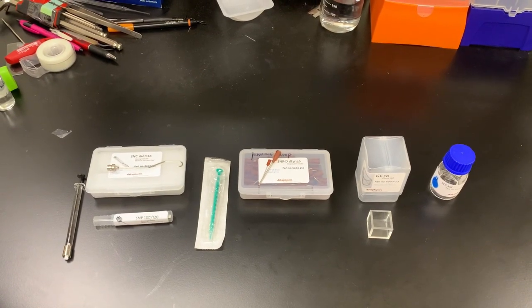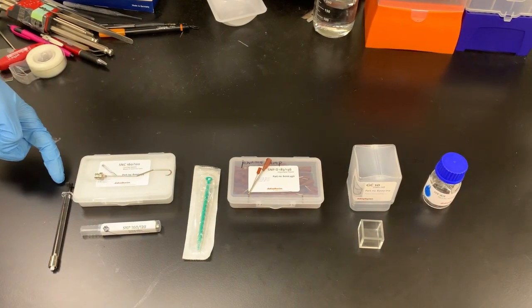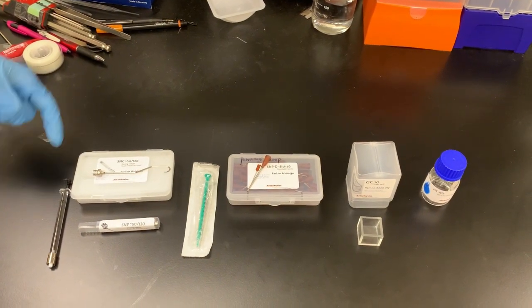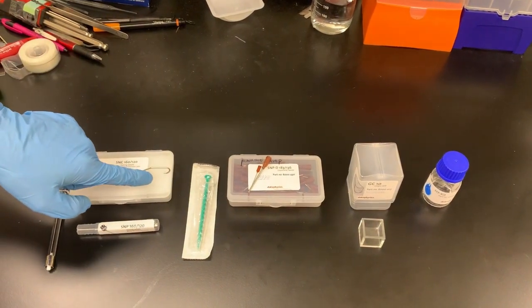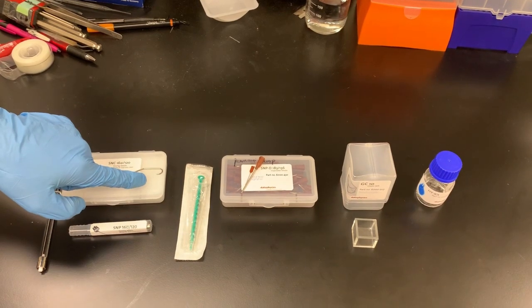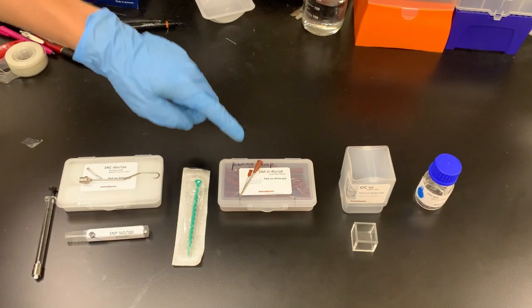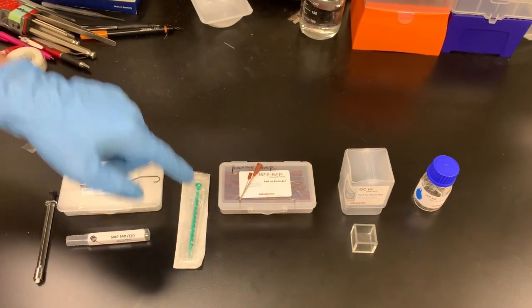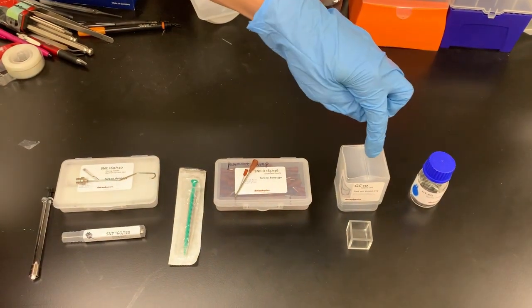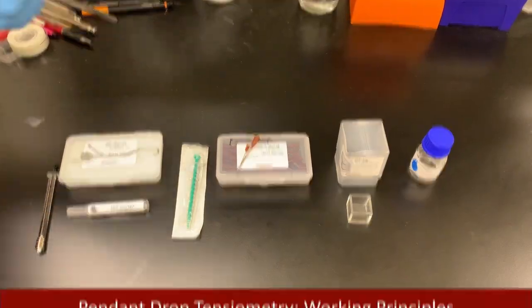Pendant drop tensiometry requires a number of accessories, including a gas-tight glass syringe, an inverted pendant drop needle, which has a blunt tip and wide diameter for droplet stability, a disposable syringe, a standard pendant drop needle with a similar blunt tip and wide diameter, a glass cell for holding your continuous phase, and a hydrophobization kit.